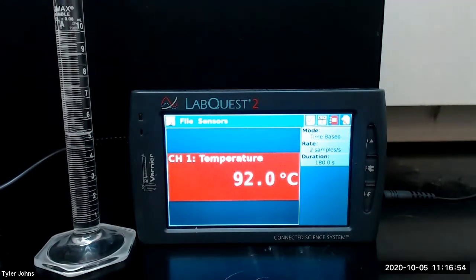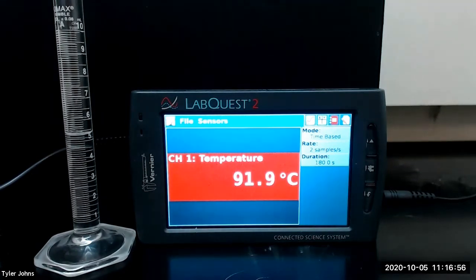We're now at five milliliters, so we'll take our next three to four drops in a GC vial.